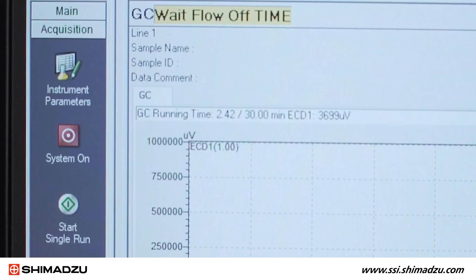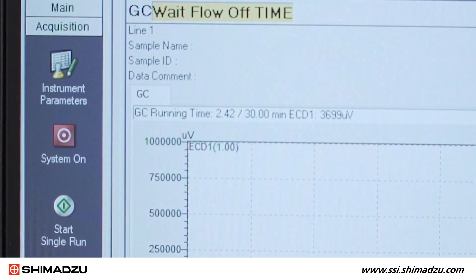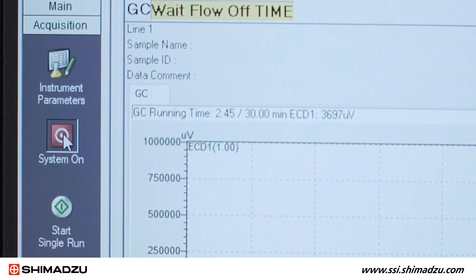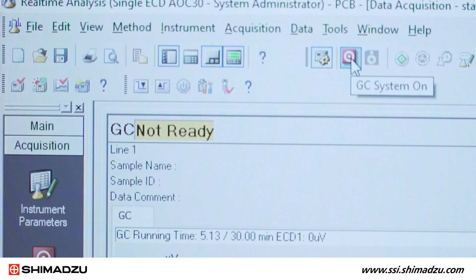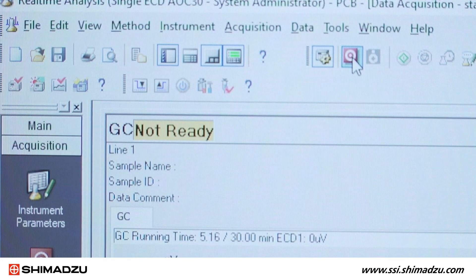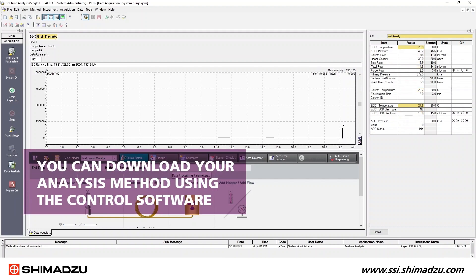You can now start controlling the temperature and flow of your GC unit. From the Lab Solutions software, you can either press System On from the Acquisition menu at the left, or press System On from the top toolbar. Once the GC system has been purged out successfully for 20 to 30 minutes at room temperature, you can download your analysis method using the control software.